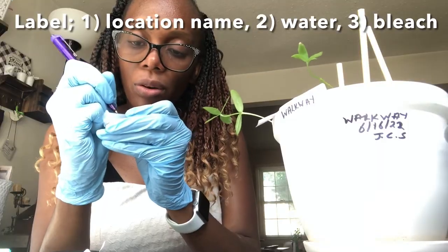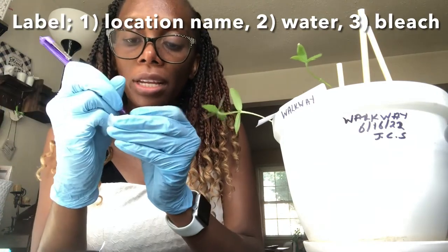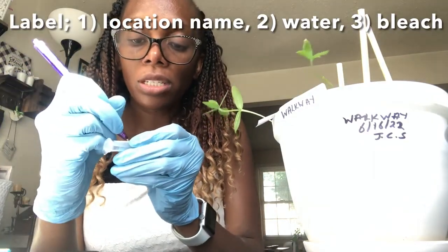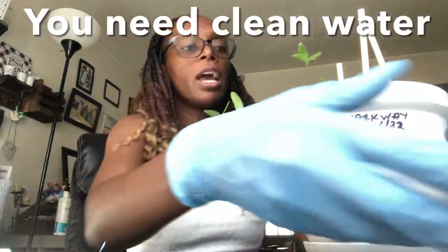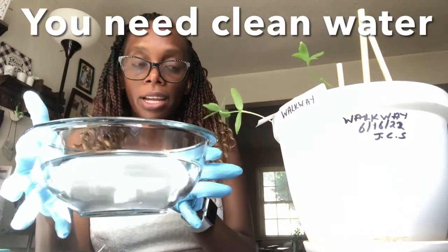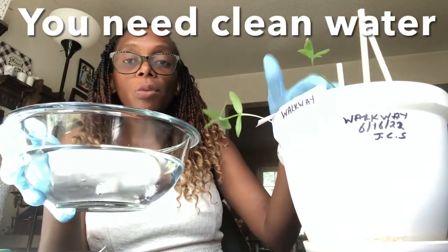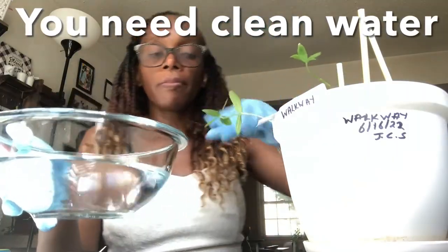So you can use a Sharpie or a pen. So walkway. And then on the other one, you can just put water. Okay? And in the third one, you put bleach. Okay, so I have my 3. And one thing that I forgot is that we need clean water. Clean water that we're going to use to make our dilutions, and then later put in the pot to help soften the soil so we can actually dig up our plant, and then rinse off the soil particles.